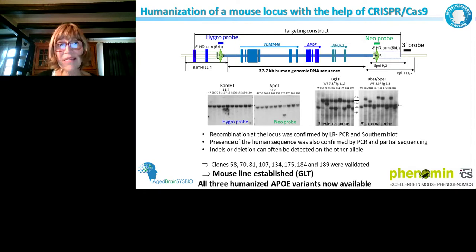Then we confirmed that the humanization was correct. Everything is there. We humanized ApoE, Tom40, and ApoC1 because it's what our collaborator wanted to have. And I have to say, with the three versions of ApoE, we obtained germline transmission without any problems. Then it was pretty easy. And even if we used ES cells, in a year we obtained the 3 lines. And it's not so easy to obtain that through CRISPR. Then we obtained the lines.